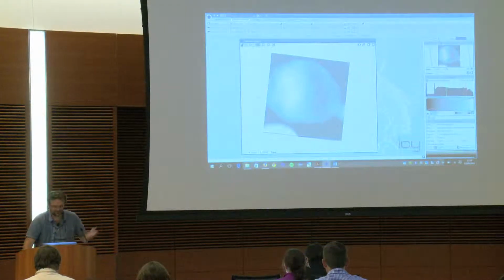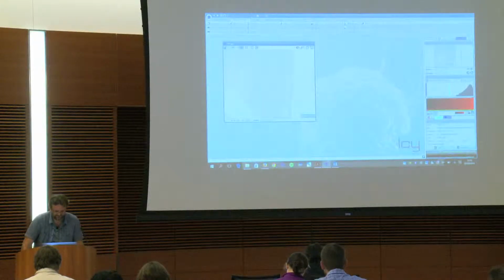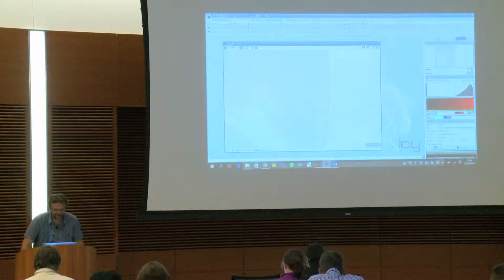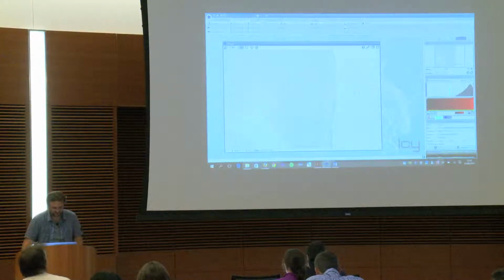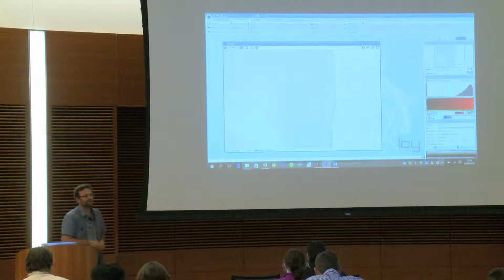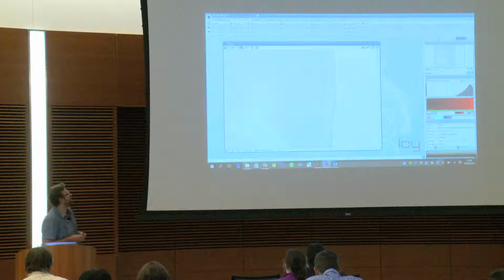Now I'd like to show you something, because this morning we saw it too. So I take this image P7, and what I would like to do in this image is being able to say that here we have more neurons than in here. When I started my job, you could publish, you could say, okay, but you see it's obvious, so don't ask me, and so on. Now they want numbers for everything, and they're right.